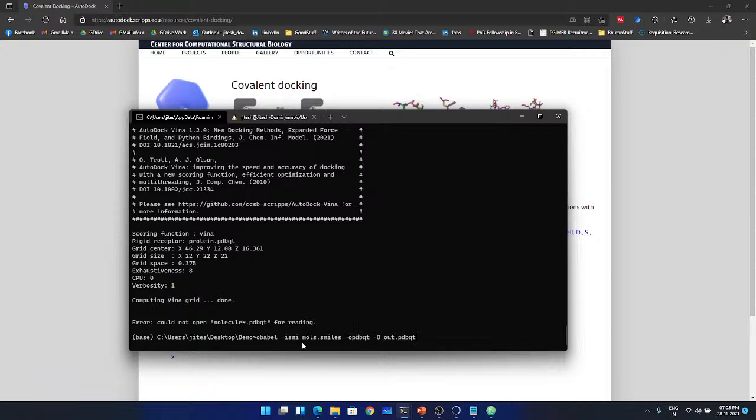Here, no matter which input file you have, you can specify the format, or you can directly use the file name without this specification. The extension should be enough. So you can use SDF files, mol files, PDB files, mol2 files, any files you have, and directly convert to any other format. But always remember, specifically for SMILES, perform the correct conversion.